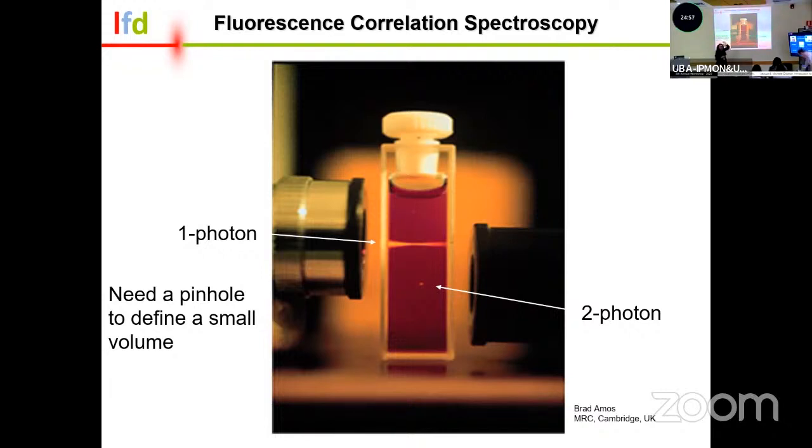That comes back and we can generate the geometry of that focus beam. Two photon excitation, we have a high density, high probability of finding two photons in that particular spot to excite the electrons from our fluorescent molecules. That's exactly what we're doing, right?